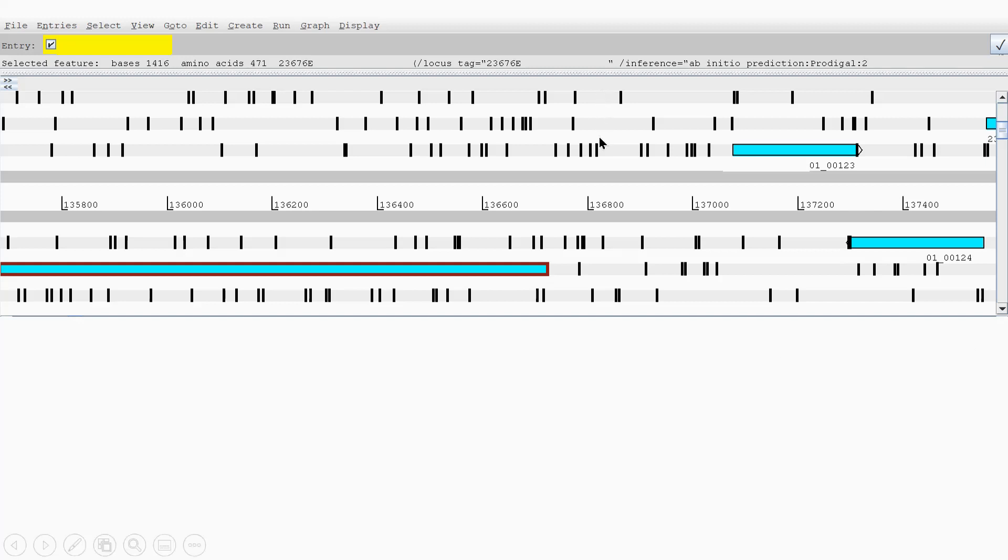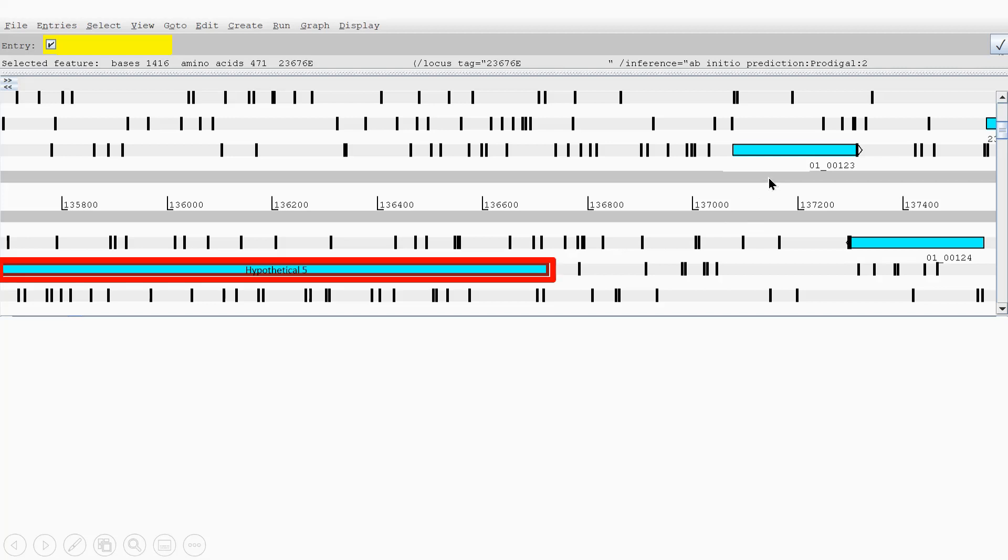Here you can see the six-frame translation tracks here, three in the forward direction and three in the reverse. On here, you have hypothetical gene five and six, and these small vertical lines represent the stop codons.